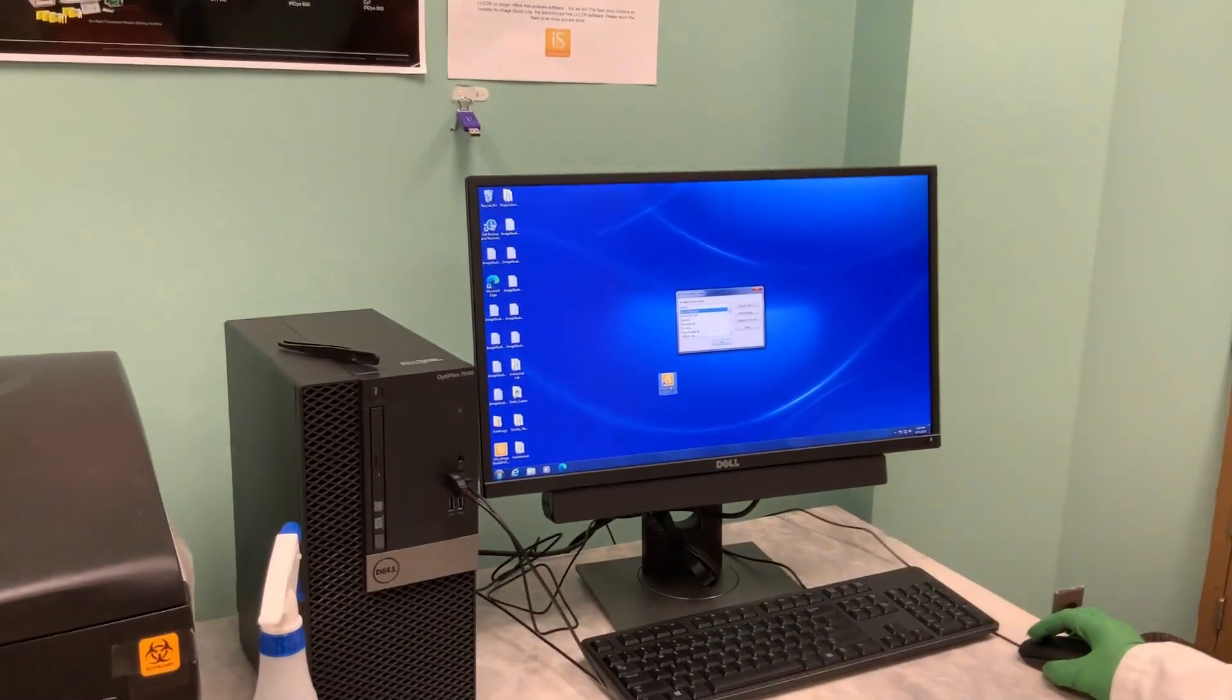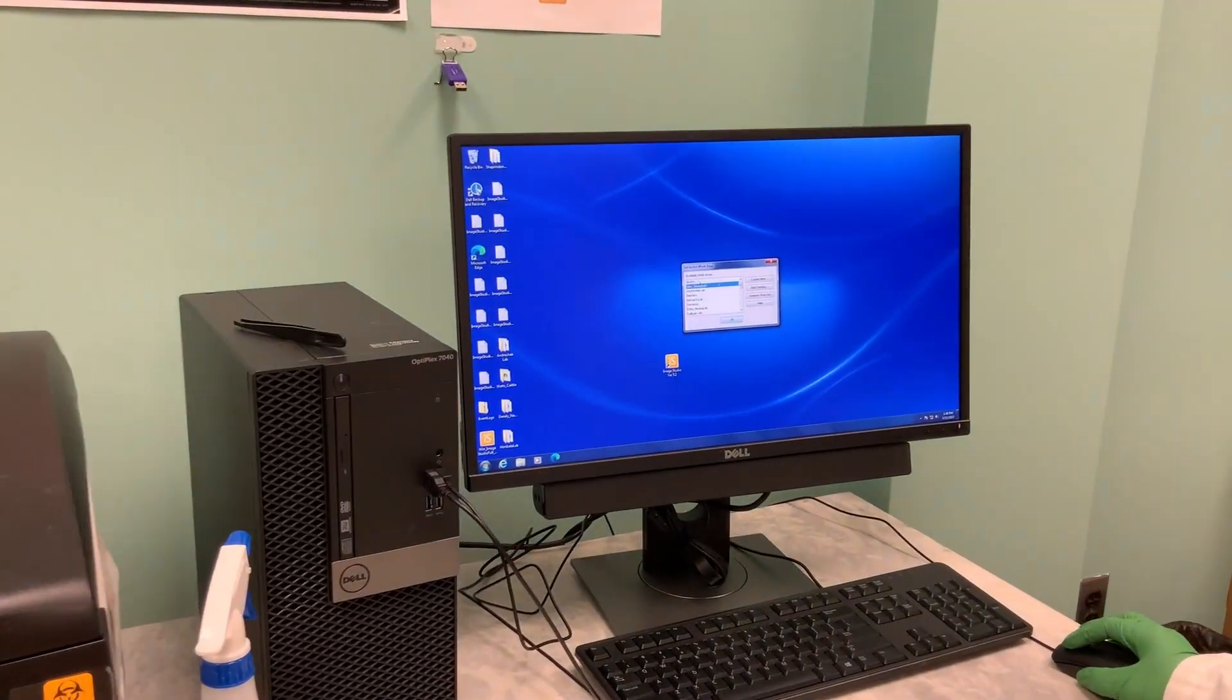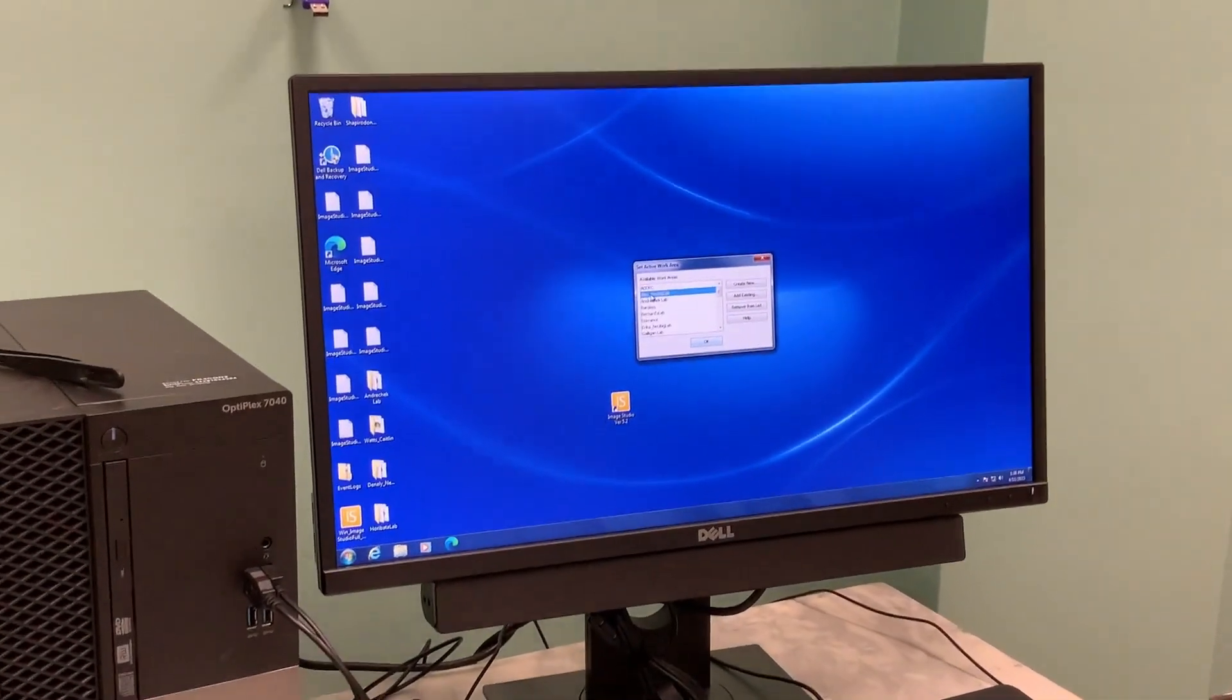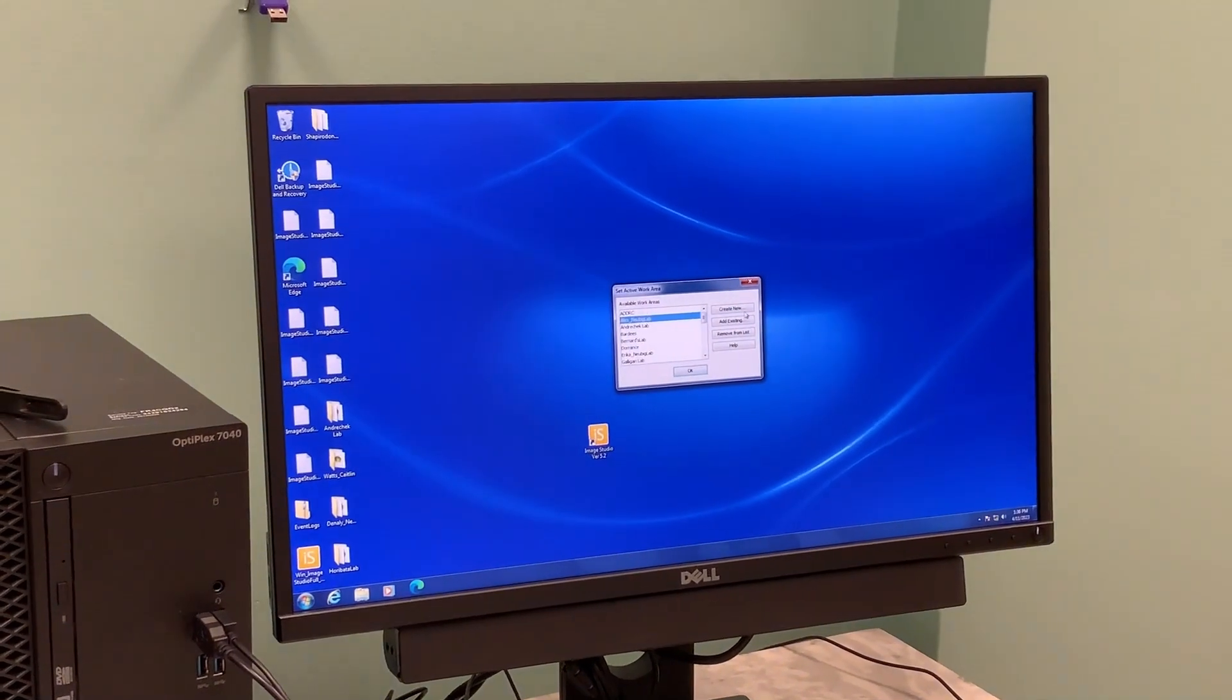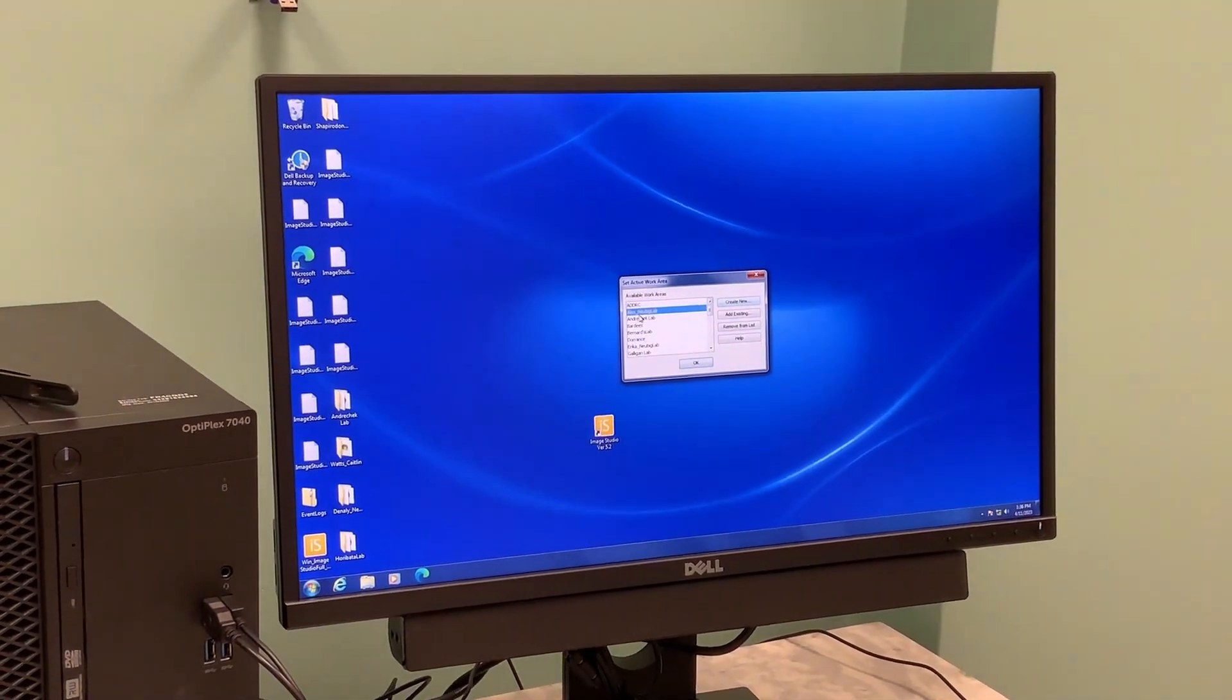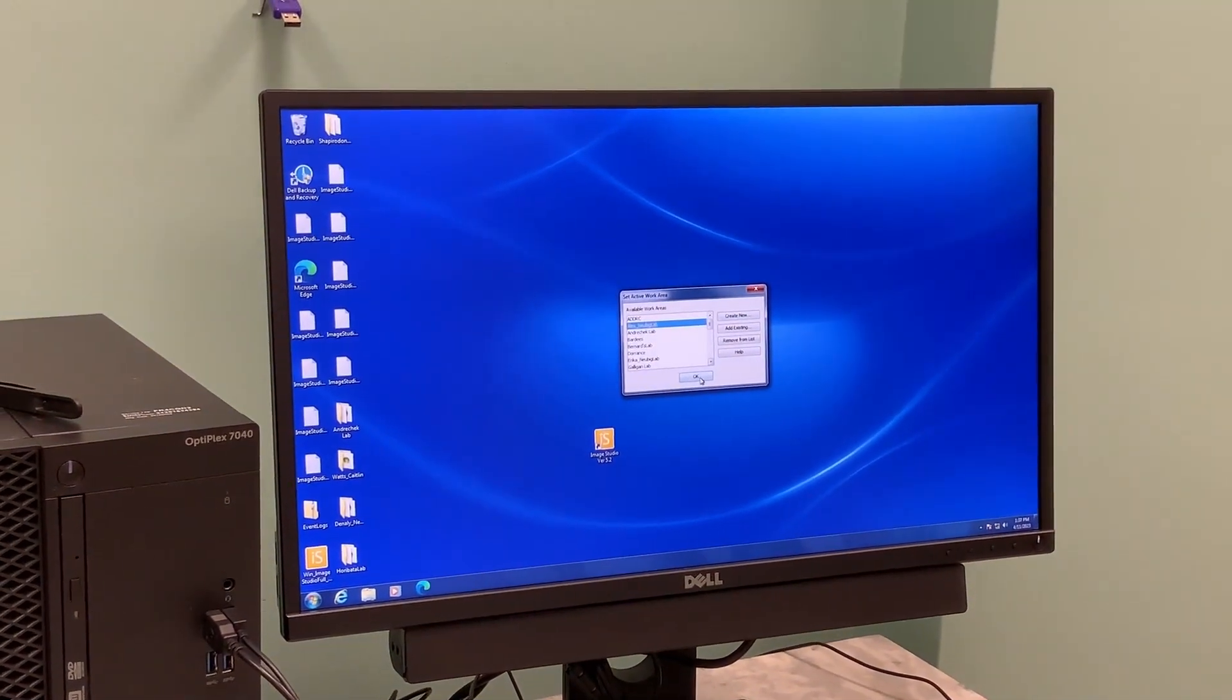Open Image Studio and you can pick your work area. If you don't have one, you can create your own area, so I'll go into mine.